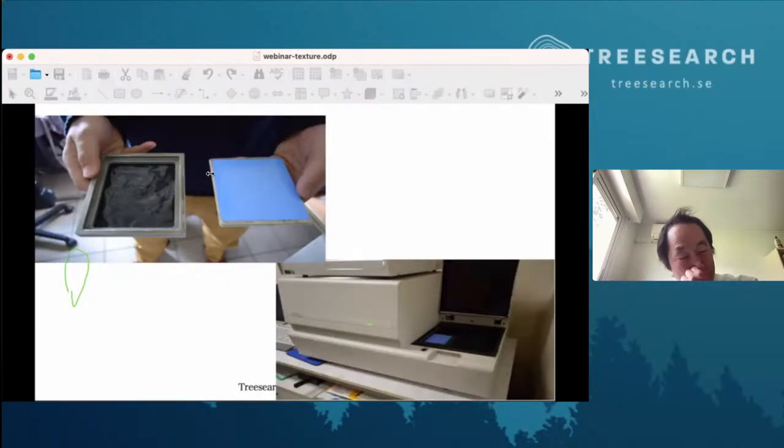So nowadays, since 25 years, we use this kind of plate, which is called imaging plate, which we can reutilize many times. So this is a reader of imaging plate. Compared to photographic film, where we have to have a dark room, we don't need the dark room, and we can just get the digital data quite easily. This has been popular for maybe 5-10 years, around the 2000s, and now many people are shifting to the X-ray camera, digital detectors.